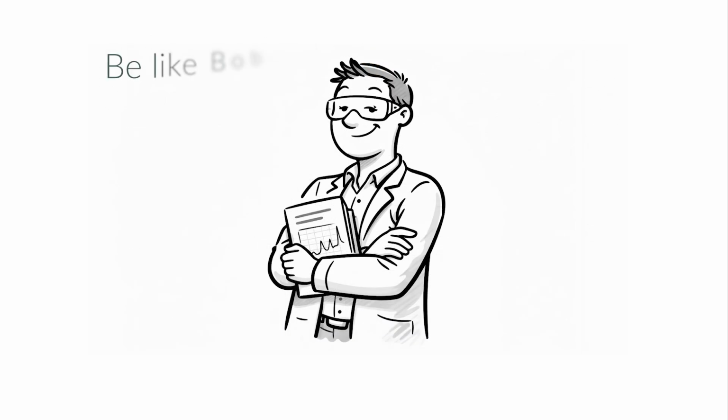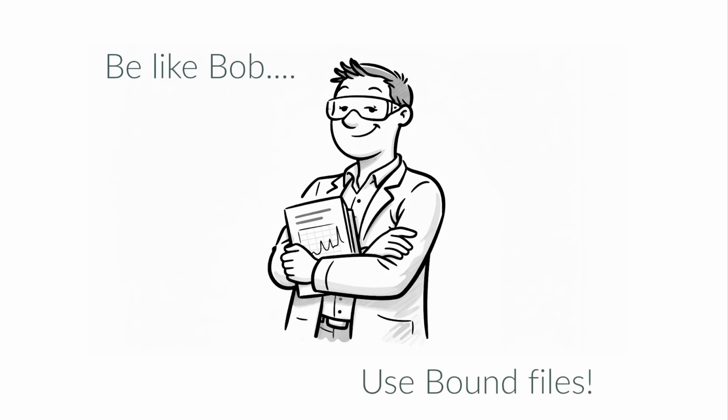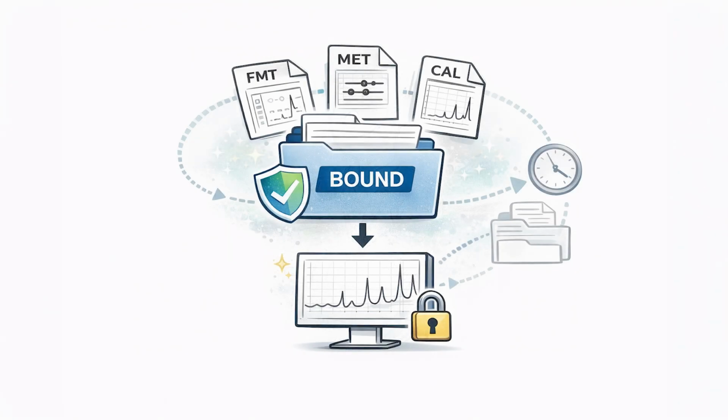A bound data file creates a processing snapshot. It contains the original raw signal, along with an internal copy of the method file, calibration file, and report configuration that were used at the time it was created. When you open a bound file, Chromperfect still processes the data. The difference is that it processes using the internal method and calibration stored inside the bound file, not the external files that may have been modified later.